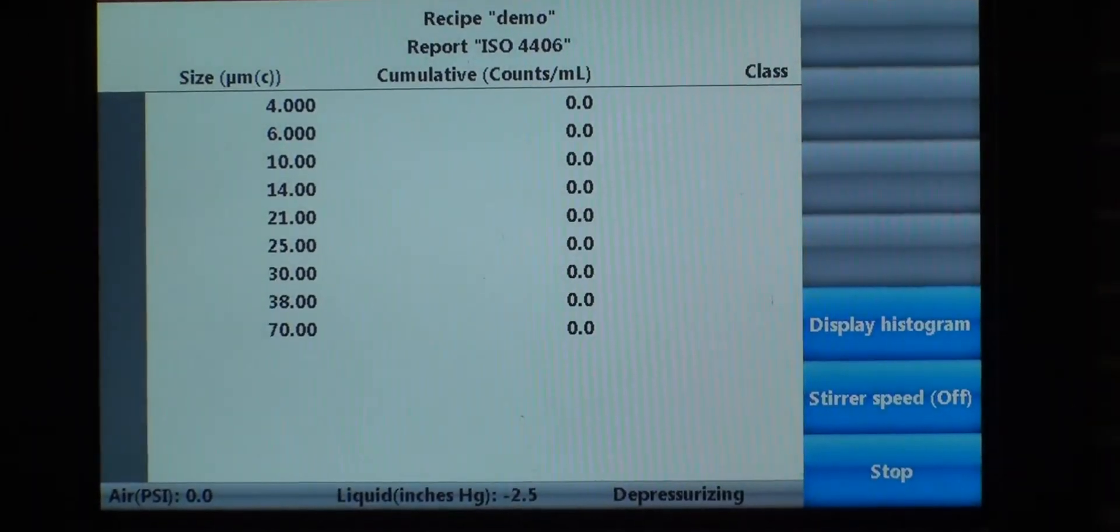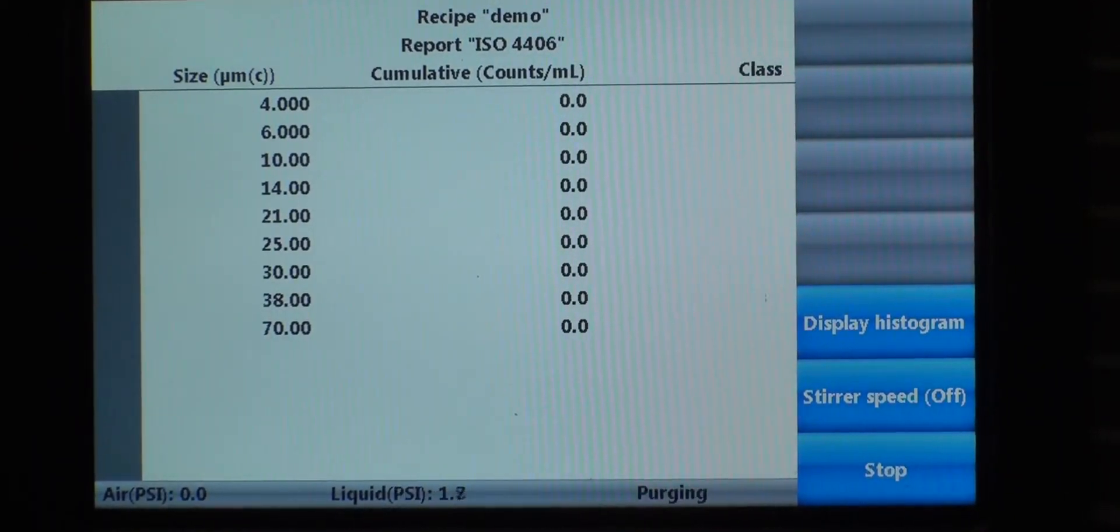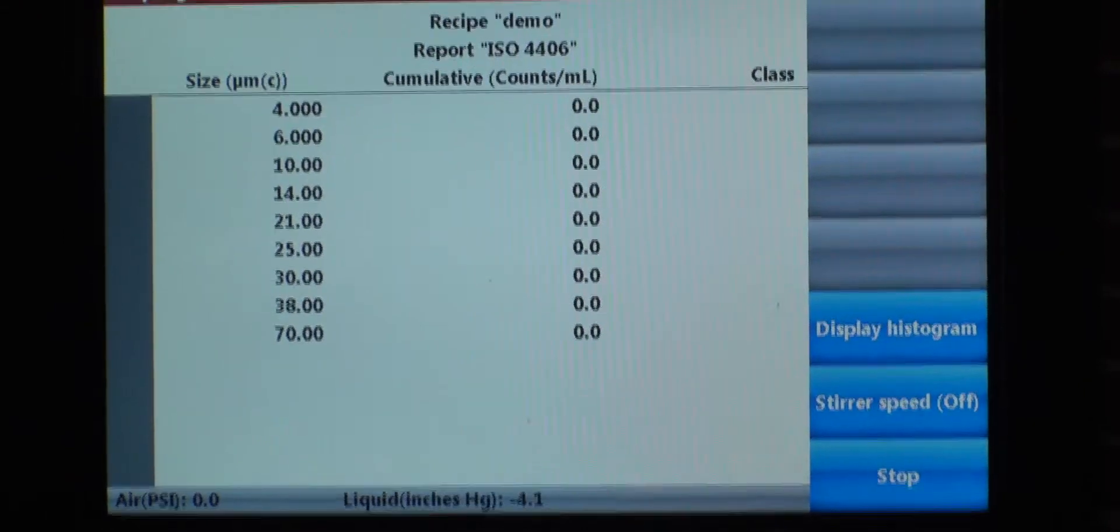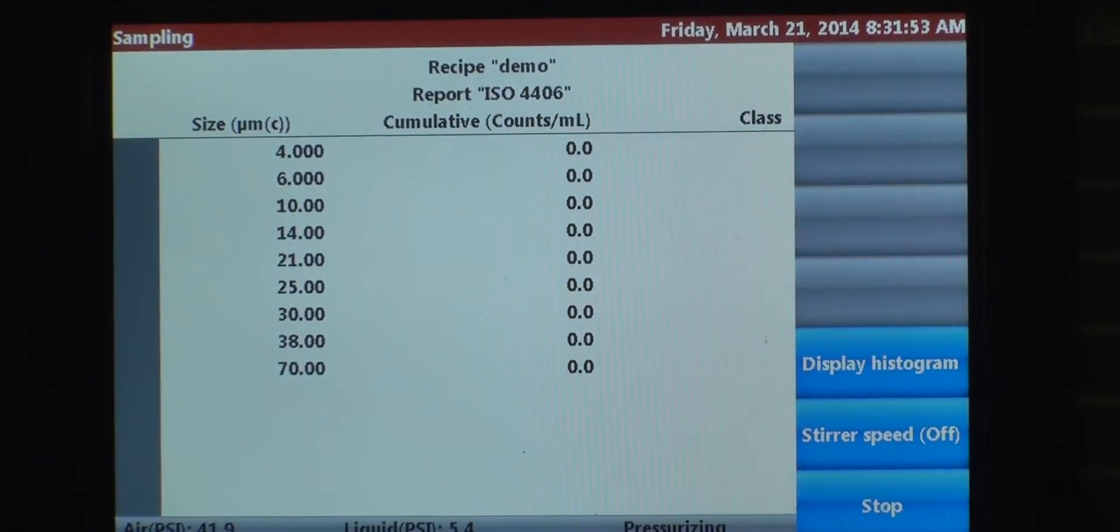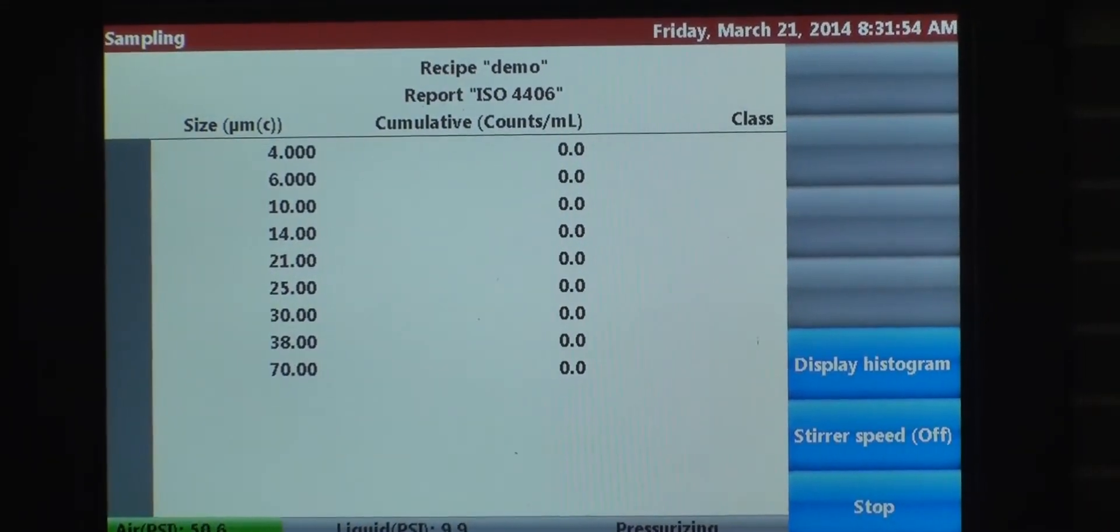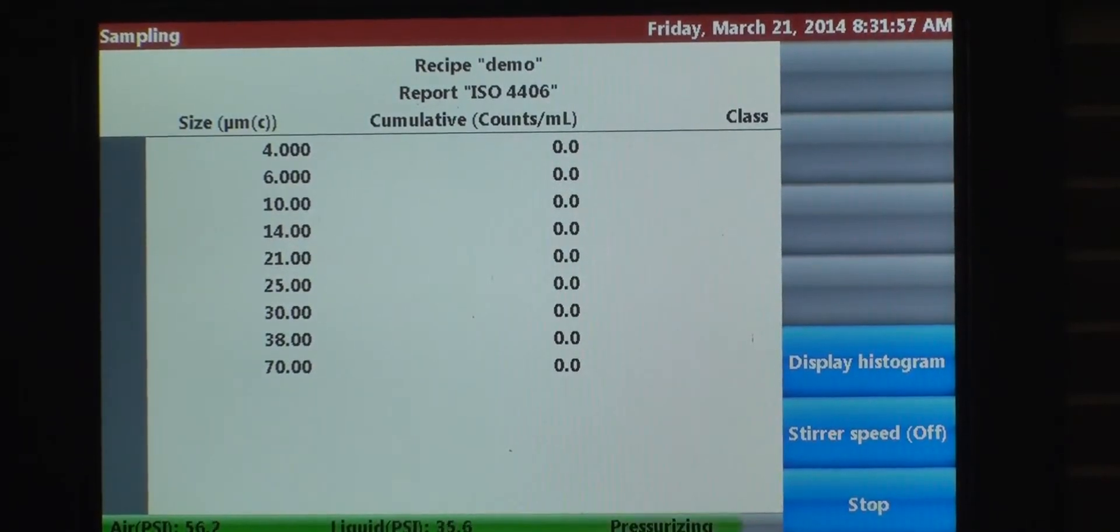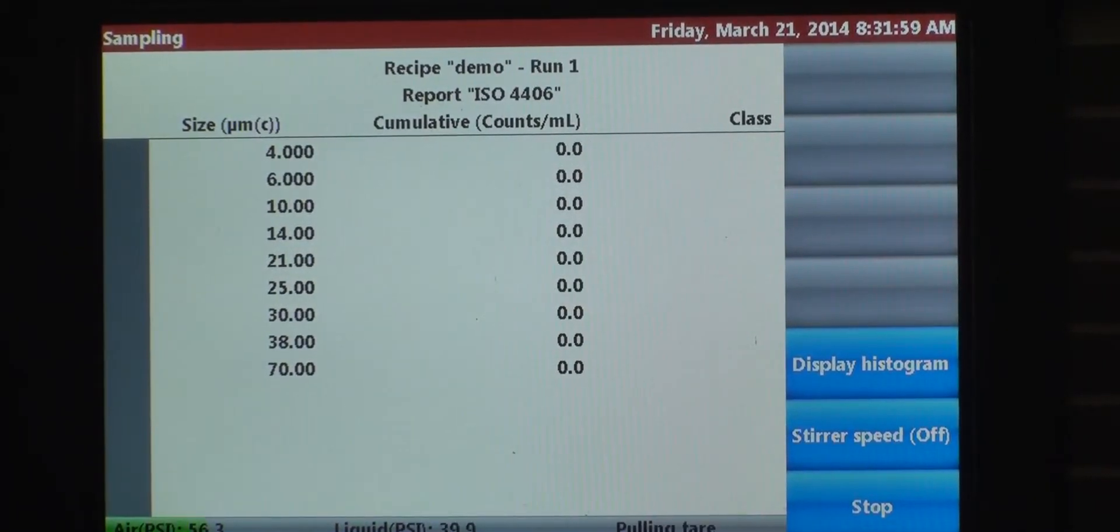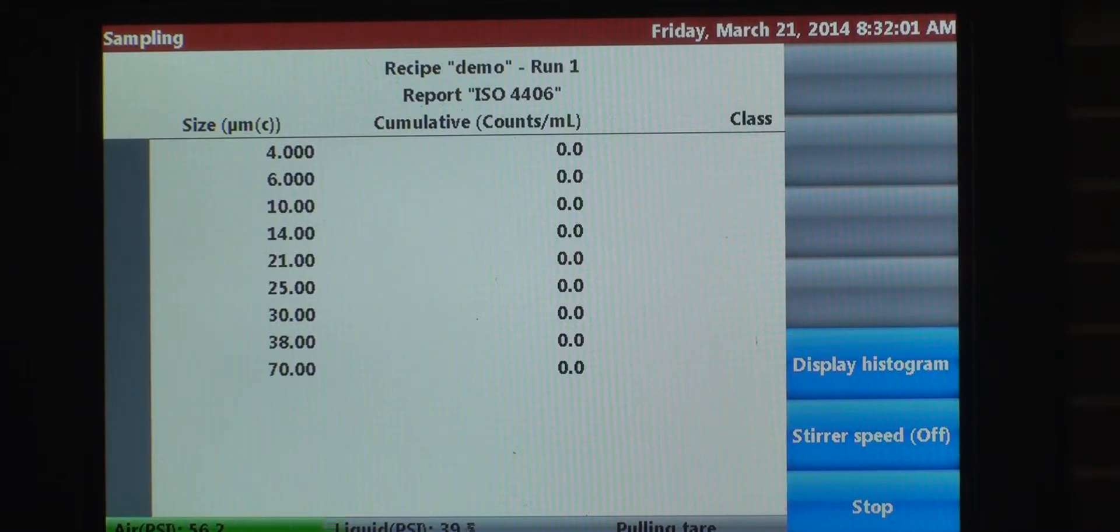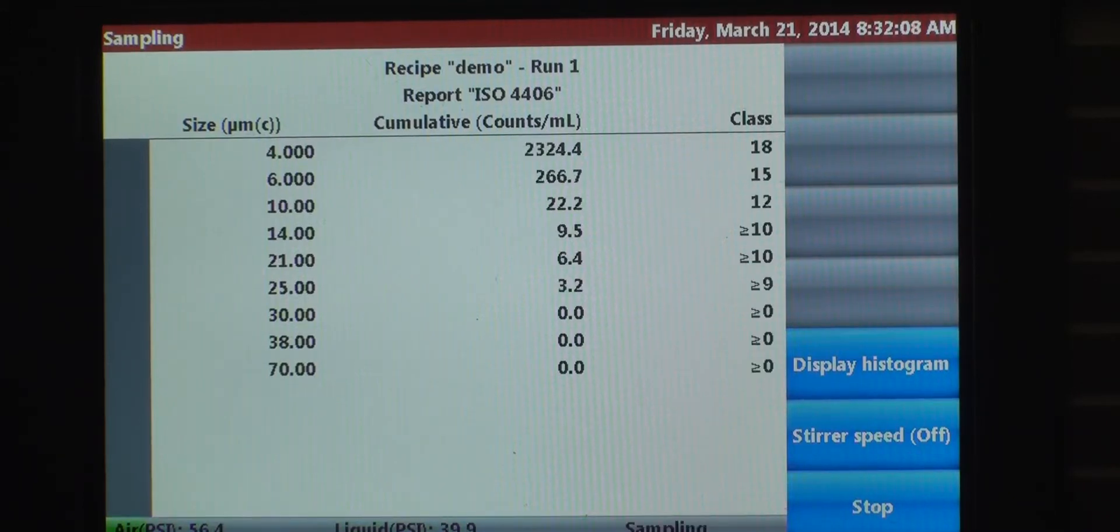And we're sampling. As you can tell, the instrument's very quiet. There's a progress bar on the bottom. It tells you that the instrument is pressurizing. This is our first run of three. It's pulling the tear volume right now. And now it's sampling.